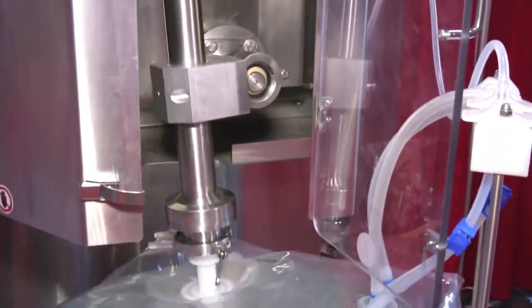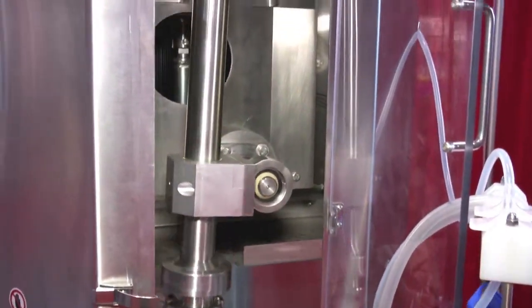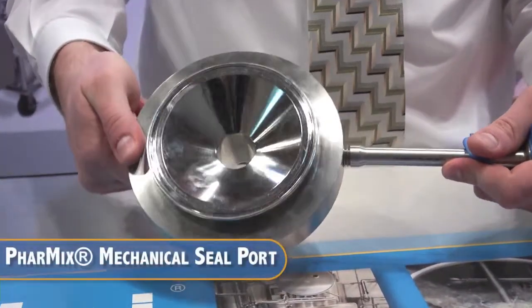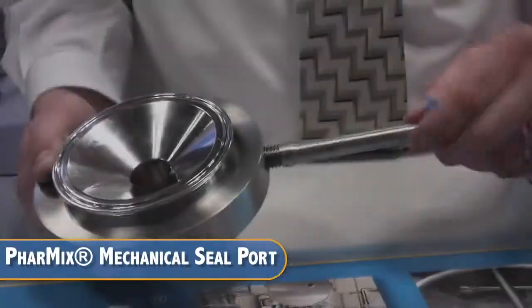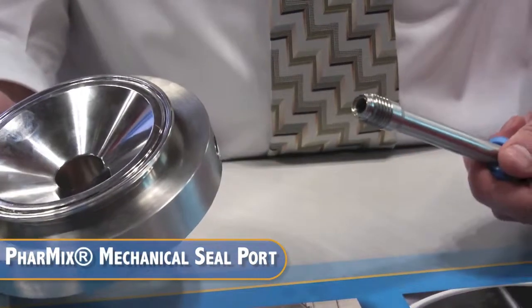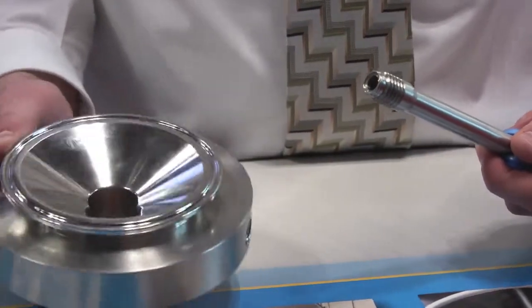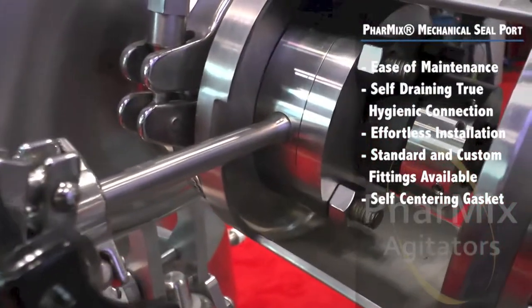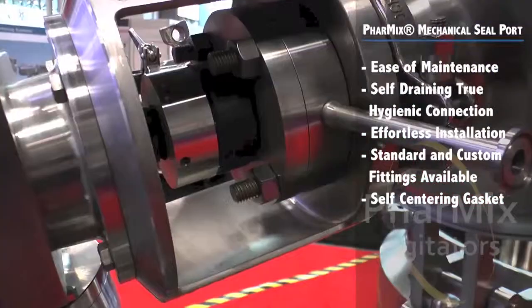Our top-entering models include two unique patent-pending features. The Pharmix mechanical seal port eliminates welded sanitary fittings or pipe threads on seals, making maintenance and assembly effortless as the seal doesn't have a protruding fitting. The flush interior creates a smooth profile for easy self-draining and a true hygienic connection.